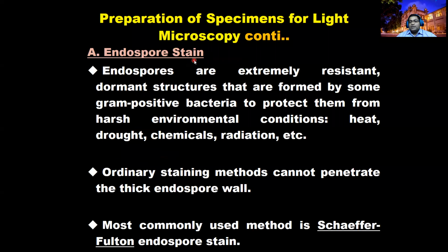So the endospore stain: how can you stain the endospore? An endospore is extremely resistant, as I told you. To escape harsh environmental conditions, bacteria produce endospores, where the individual cell is modified and converted into an endospore.